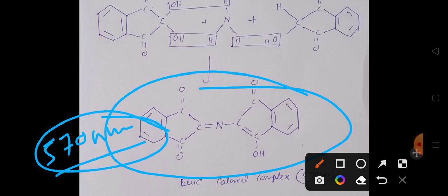That will help you determine the identity of the amino acid, and if you are analyzing protein, then determine the identity of the protein both quantitatively as well as qualitatively.